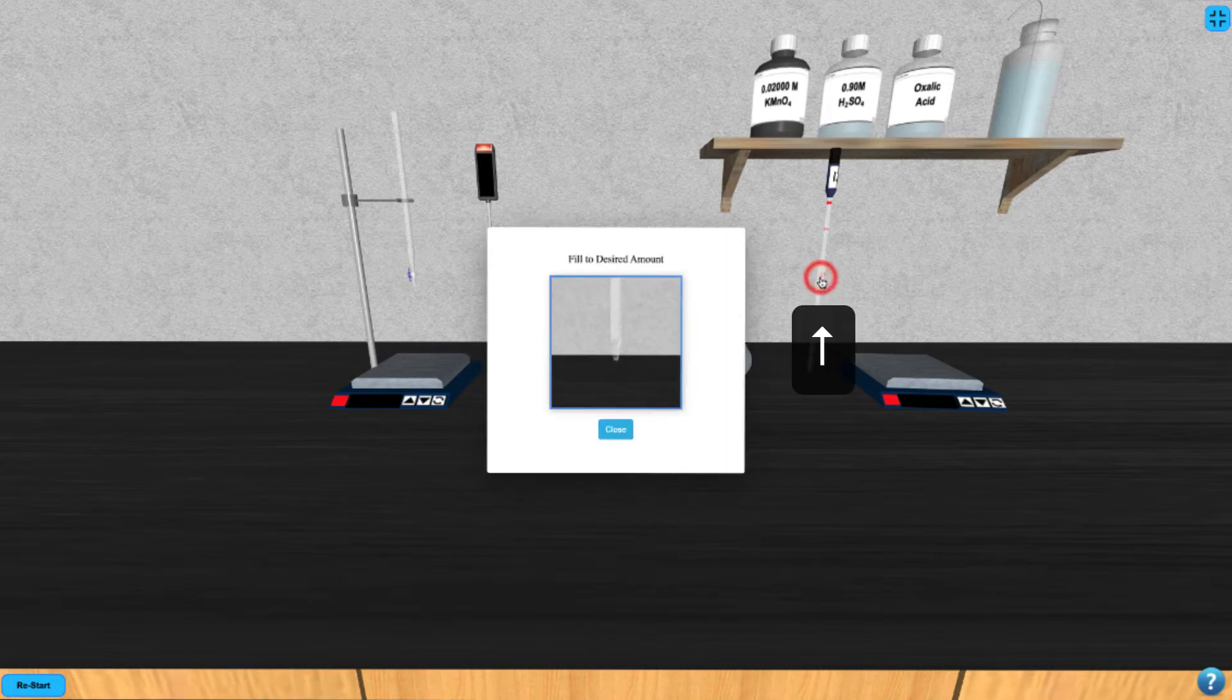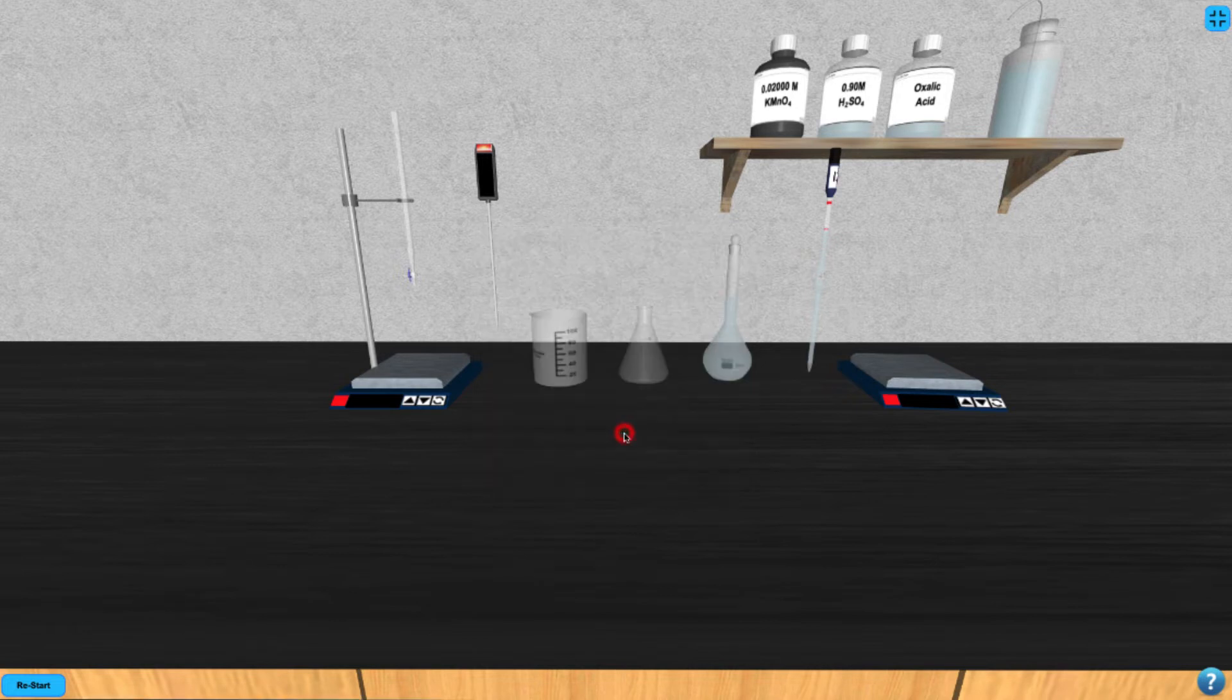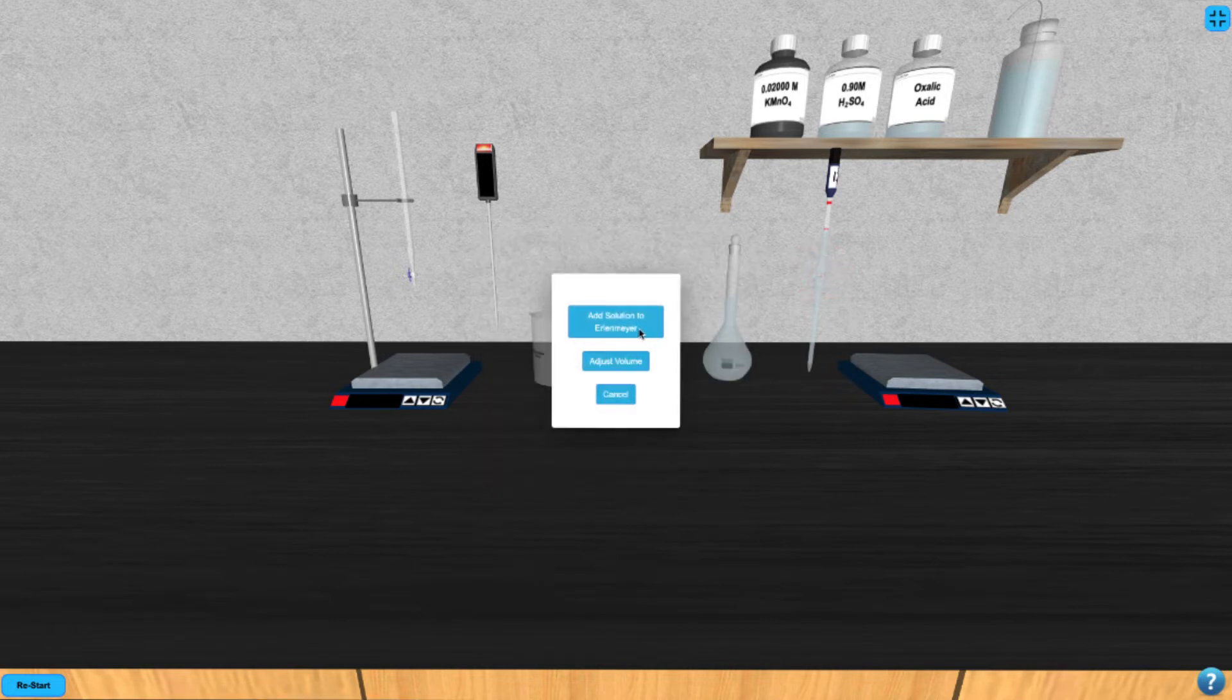Now click the pipette again to draw up 25 milliliters of the mixture and click on the pipette again to add the mixture to the Erlenmeyer.